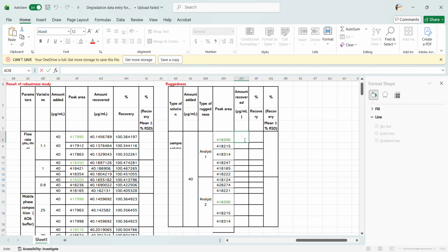Just we will put is equal to amount recovered. Then what will you do? We'll use y is equal to mx plus c. So y is equal to mx plus c means we'll just copy paste this, because for y is equal to mx plus c, here we are just putting the value, like I'm just copy pasting this, nothing else. In that area we'll use this.